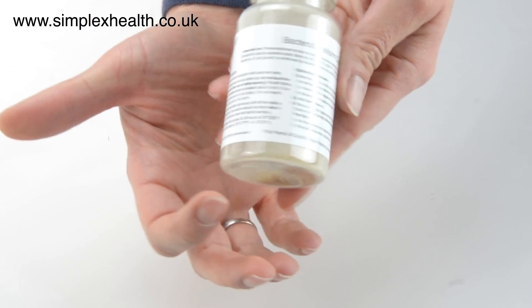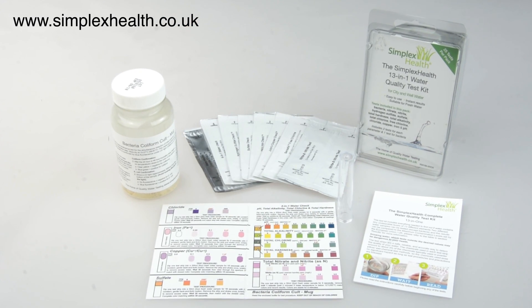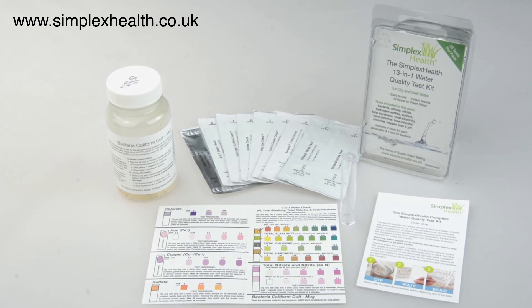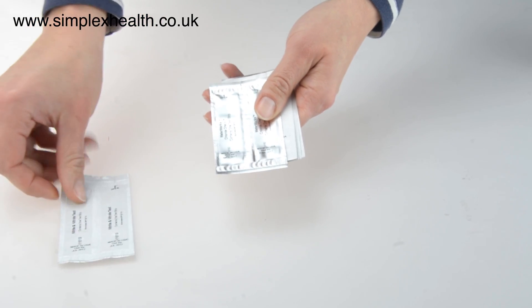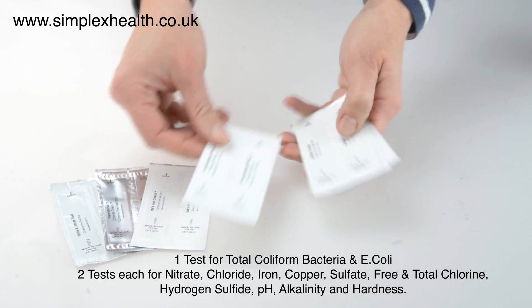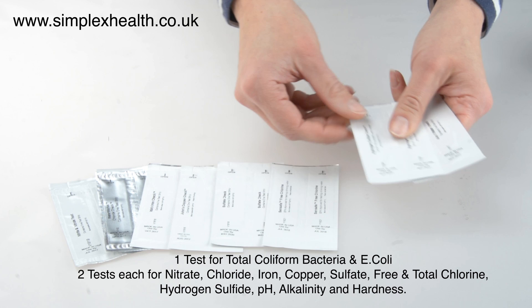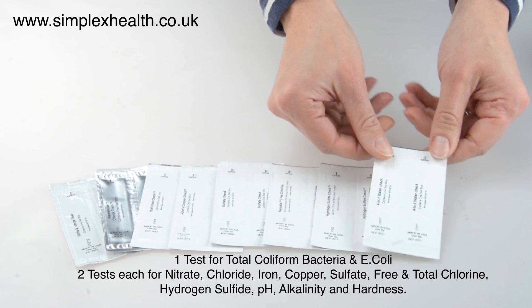The 13-in-1 is ideal to test two water samples for 12 different contaminants and one for bacteria. Tests included are nitrate and nitrite, chloride, iron and copper, sulfate, free chlorine, hydrogen sulfide, pH, alkalinity, total chlorine and hardness.